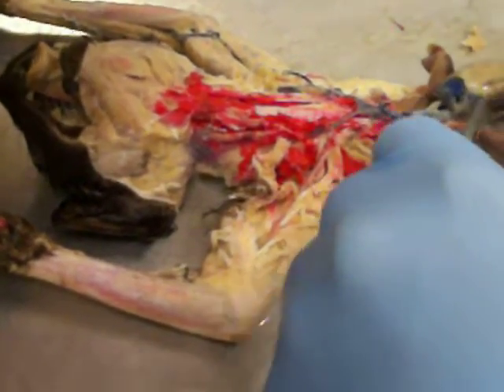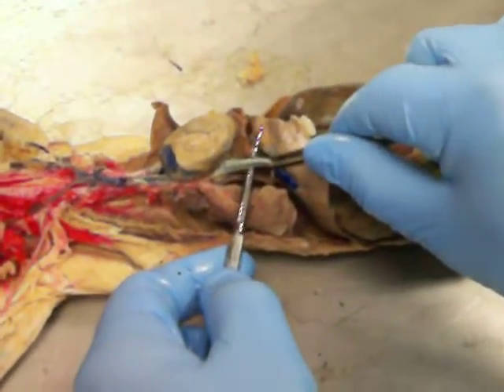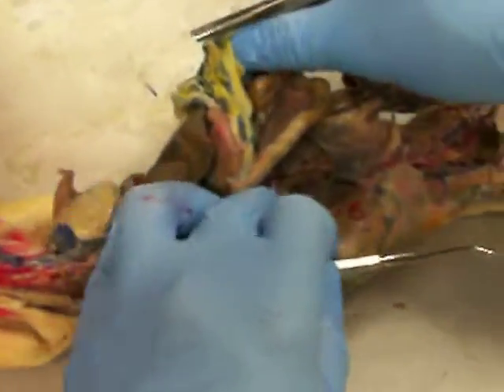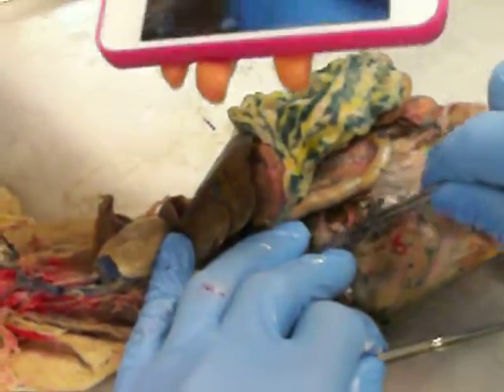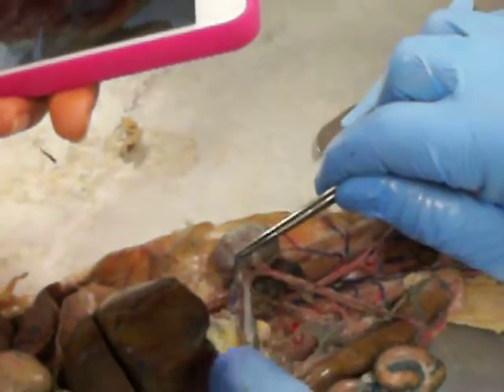Now if we go to the inferior side of the heart, or posterior on a cat, this is now our post cava, right there. And so the post cava is going to continue down through the diaphragm. There's our post cava there, and branches into the renal vein, which is right here. There's our renal vein. It's been ripped.